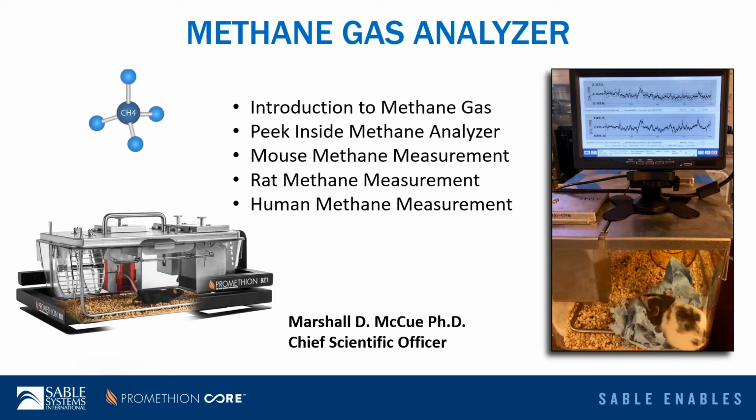Now, this methane analyzer was initially inspired by the need to explore and understand the relationship between an animal and its gut microbiome. Recent advances in gene sequencing have allowed researchers to easily characterize the community structures of the microbiome, but understanding the actual impact of the microbiome at the whole animal level offers a new horizon for research.